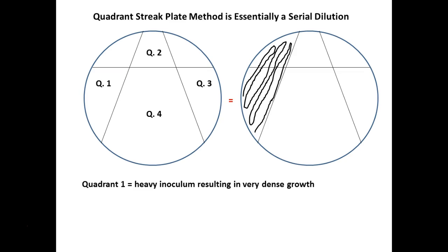So what you're going to do in that first quadrant is take your loop and basically do invisible coloring, because you're not going to see the organisms in large numbers until they grow. Start at the top of your plate with your loop and go back and forth, covering the entire first quadrant. Notice it crosses into the second, all the way down to that line border. You want to cover as much surface as possible, invisible coloring. We'll see how well you did after they grow next week.